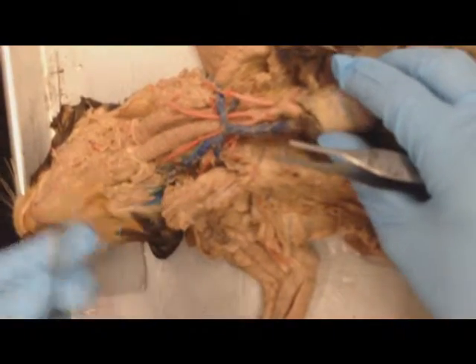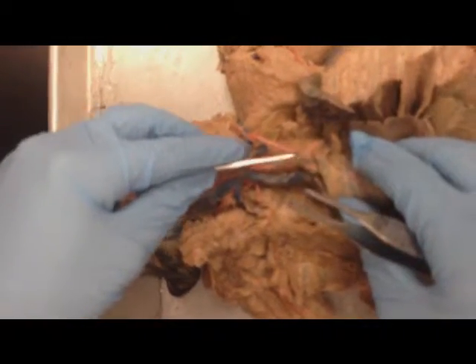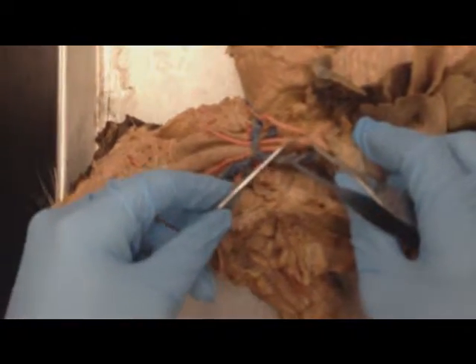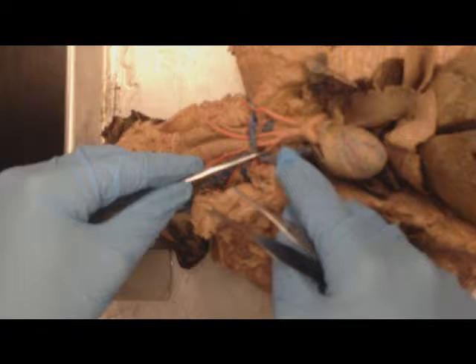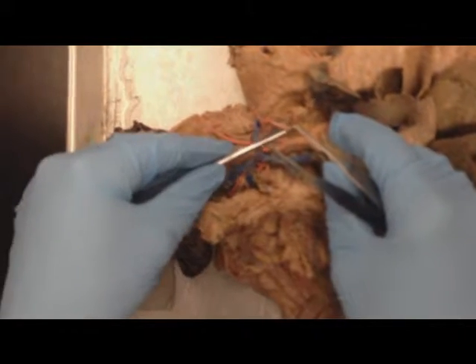I'm going to leave out the word arteries, so just add that. Here's the aorta. This cat has a very good aortic arch. So ascending aorta. From the aorta, we have two branches. Brachiocephalic is the branch that has the three branches from it. So brachiocephalic. This branch is called the left subclavian.